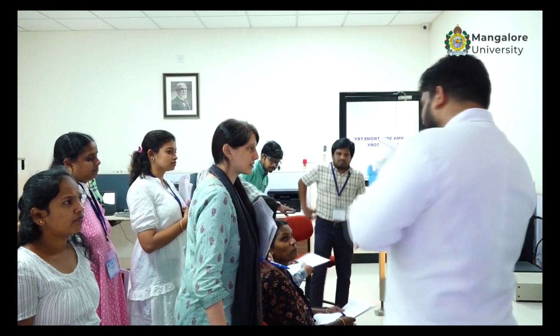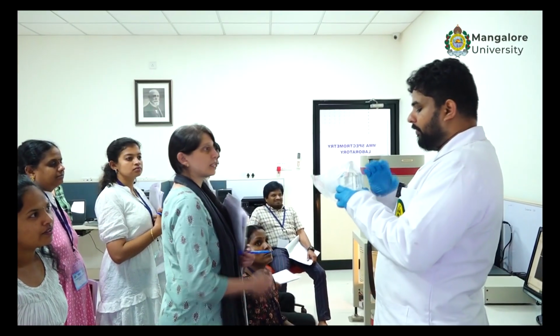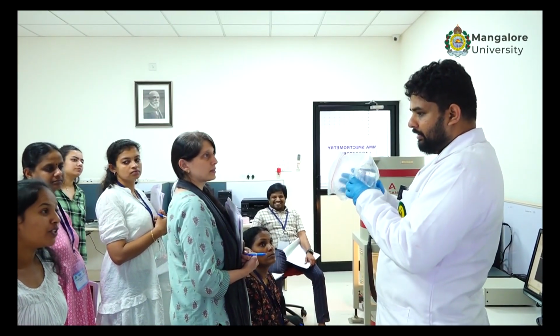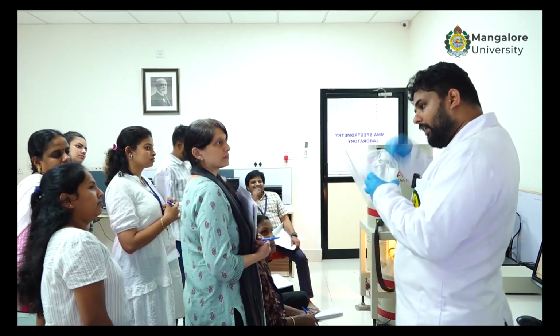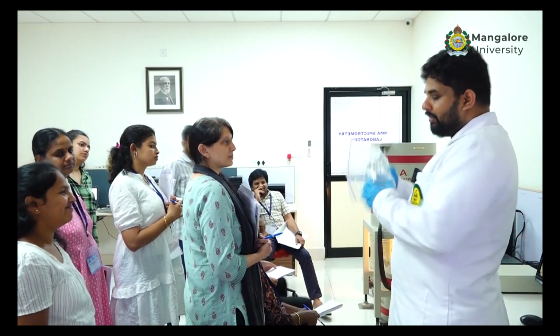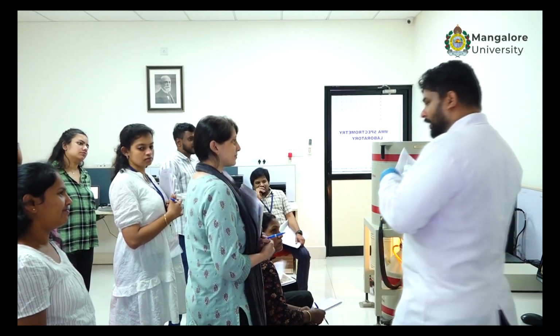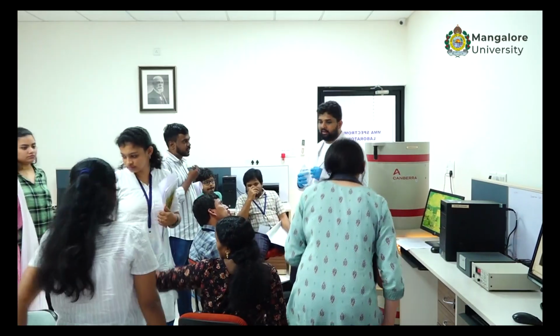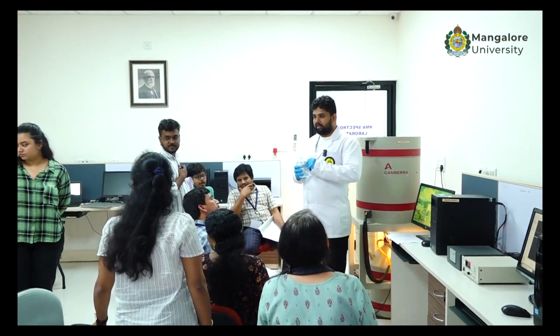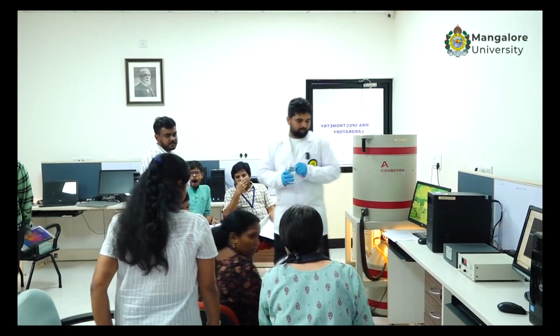Okay. So this is the QC water sample. Now I have put a plastic on it, right? If there is any dust inside the plastic, it will again affect. If there is dust outside the plastic, it will affect. But this is a fresh plastic. So that is what I said, you always assume the sample is dusty. Always assume the sample is dusty. Okay.